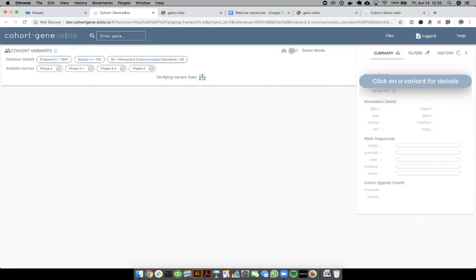One, it's calculating enrichment for variants in the cohort that I selected against the whole probands, and it's also annotating all the variants, just like Gene did, against all of these known resources. Since this is doing a little bit more of a calculation, it can take a few seconds, and so in the interest of time, I also have it open here.